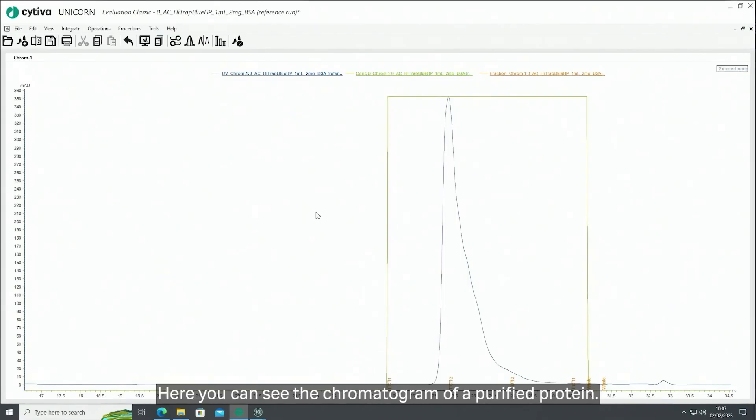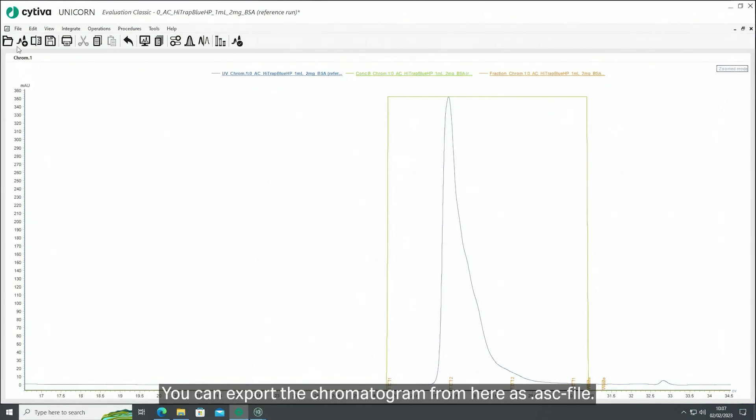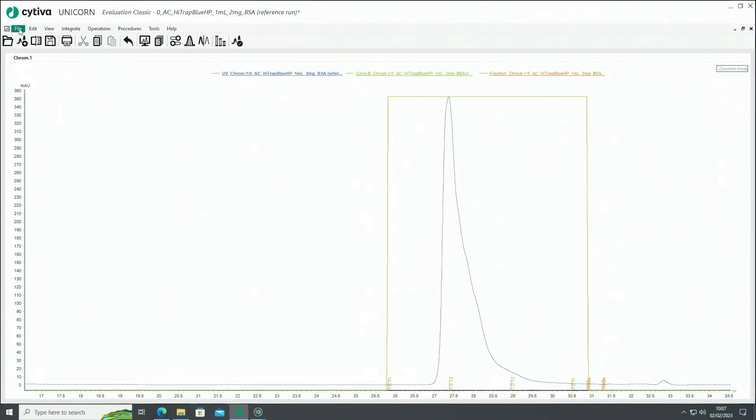Here you can see the chromatogram of a purified protein. You can export the chromatogram from here as an ASCII file.